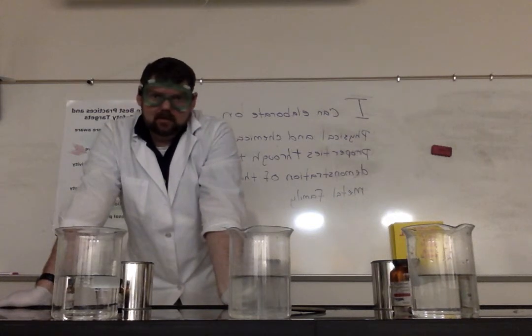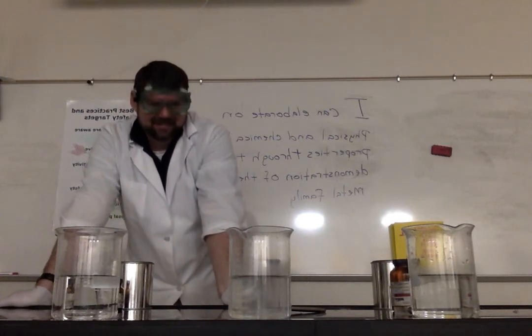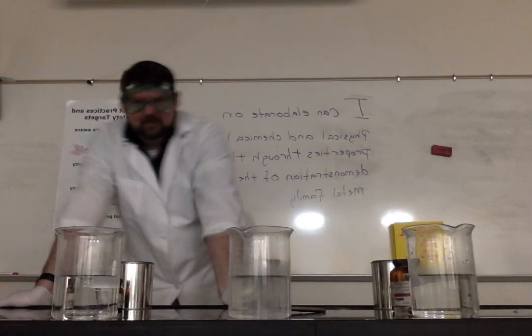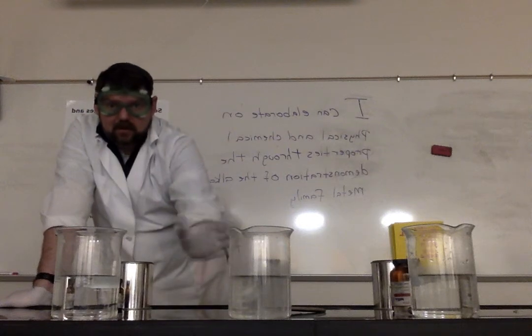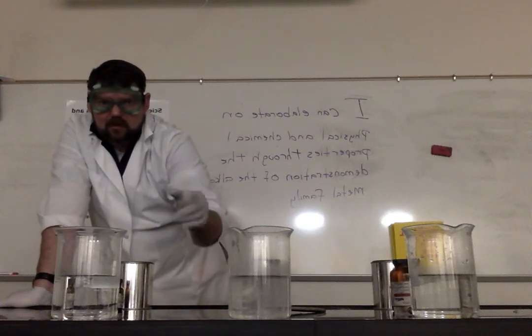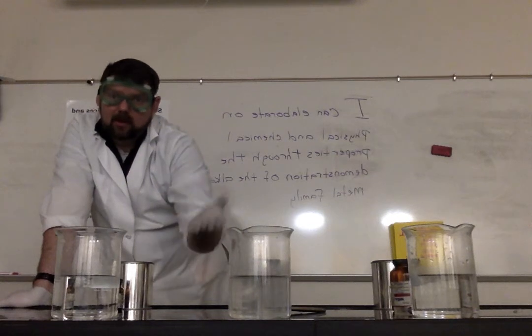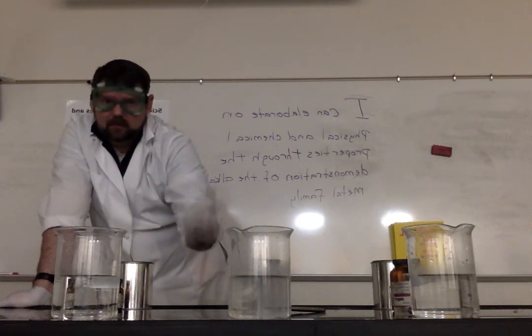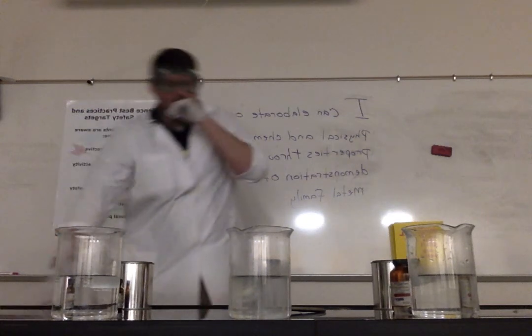I just think I'm getting so good at this that I don't get the pop anymore. But again, reactivity, we know that's happening. Not dissolving, it's reacting. If I were to put something in there, it would actually start corroding. I can actually get color paper to change color, putting it into this new substance.